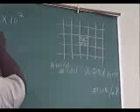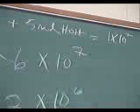And although we want 10,000 cells, what I want you to do is get that 1 times 10 to the 7 down to 1 times 10 to the 5th. If you can get that number down to 1 times 10 to the 5th, we're almost there. But to make that first dilution, just take 1 mil of stock and 5 mils of water, and that will give you 1 times 10 to the 7.